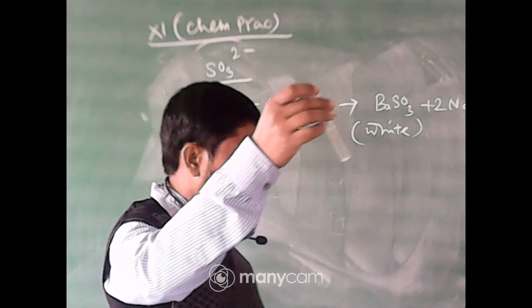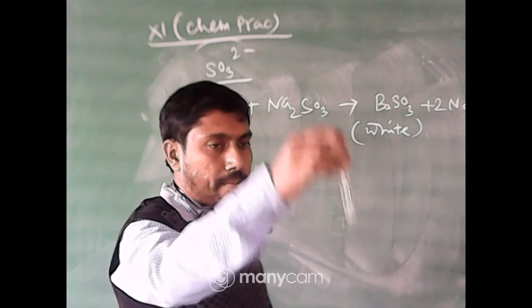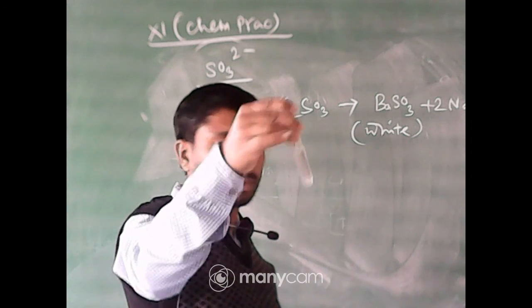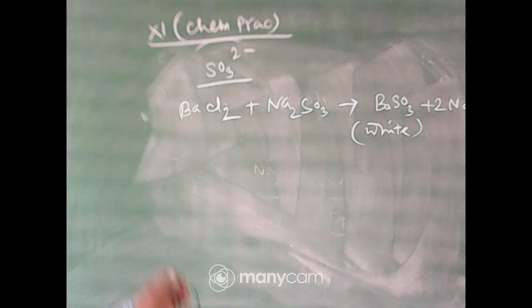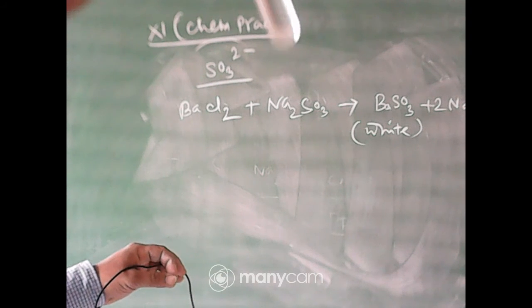Water added. Now shake it well. Shake it well. Now the solution becomes clear. Okay, you can see that the solution is clear, no residue left.